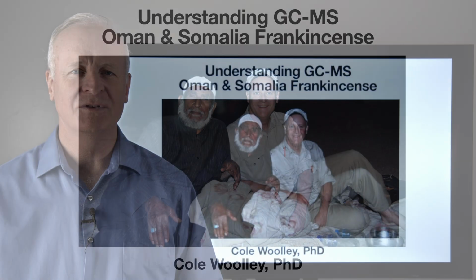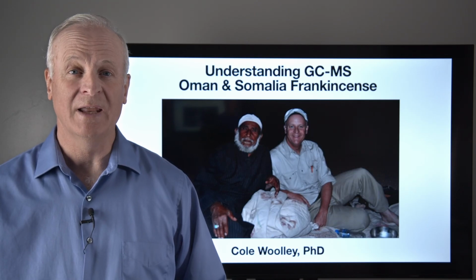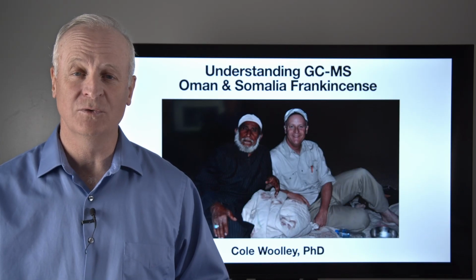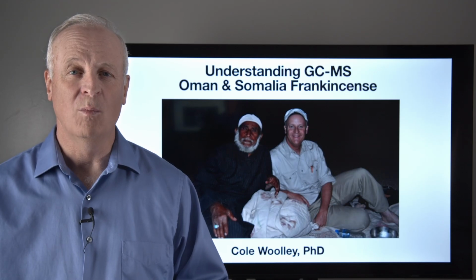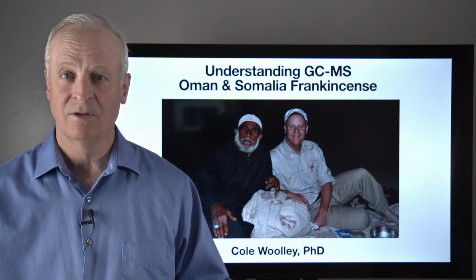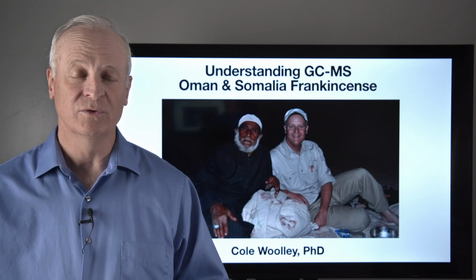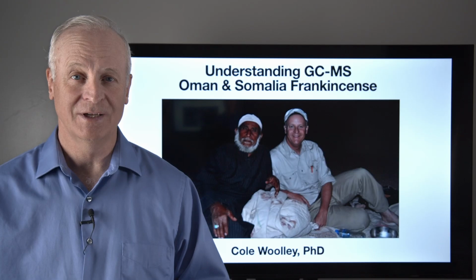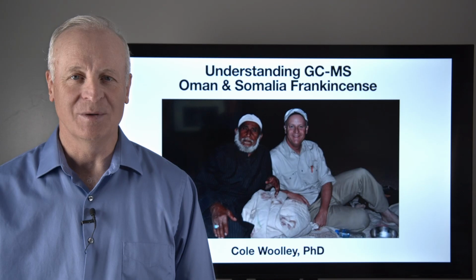This is part of a series regarding frankincense from Oman and Somalia and how to differentiate them. This is an experience that I went through in 2010 to be able to figure out the uniqueness of Oman frankincense compared to Somalia frankincense. They're both great frankincense, but I used analytical tools, analytical laboratory instruments to figure out the difference. It's a great story. Well, let's start by talking about understanding GCMS.